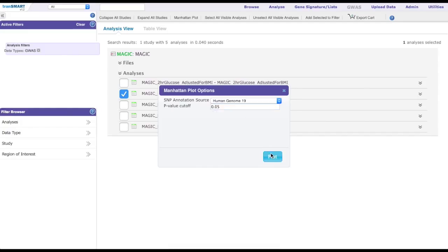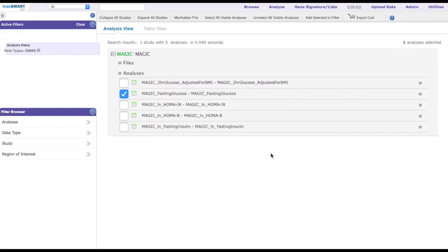Immediately, the guava.gwava.java webstart application file will download. Once successfully downloaded, click the file to open.